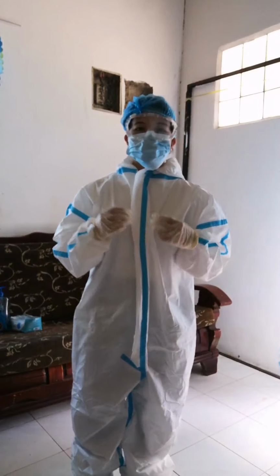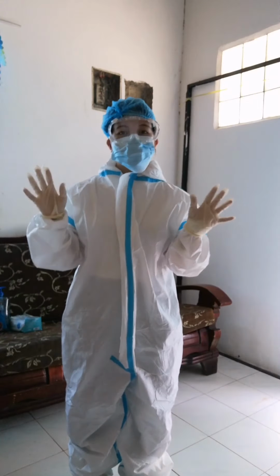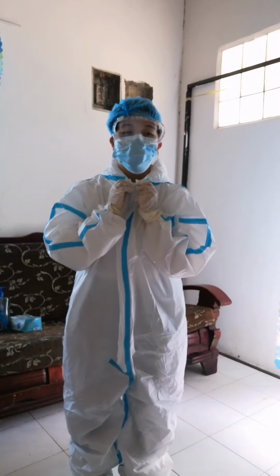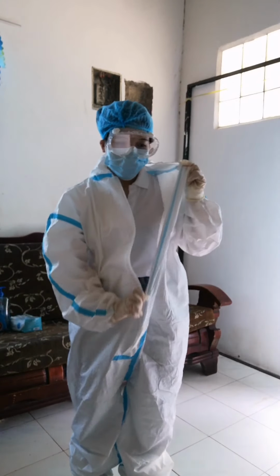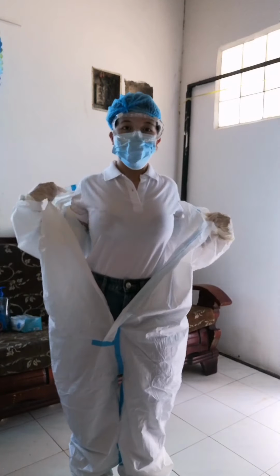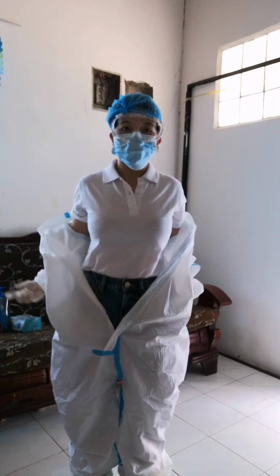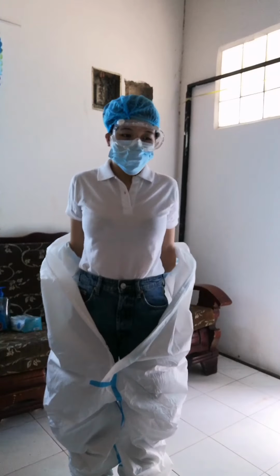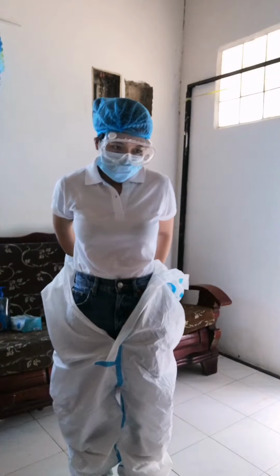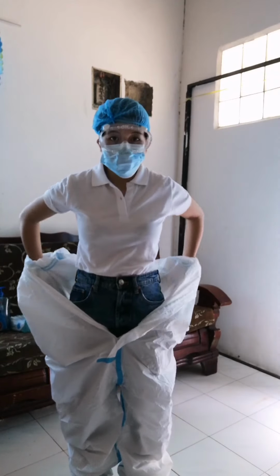So next is to doff the gown together with the last layer of the gloves. First is to unzip the gown, and then pull down from the neck. We must be careful that it will not be in close contact with our clothing. So pull down from the neck and shoulders, touching the inside of the gown only.